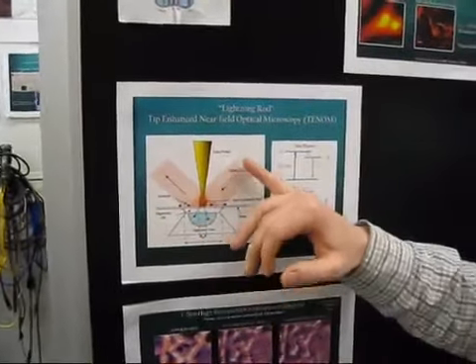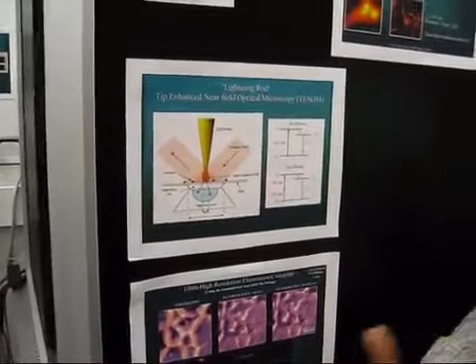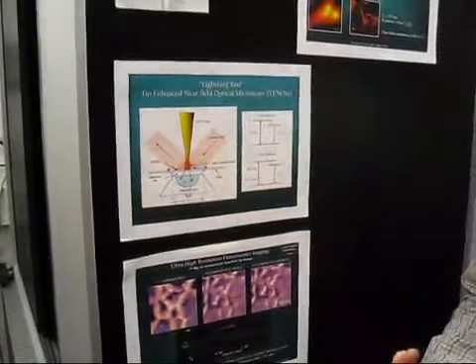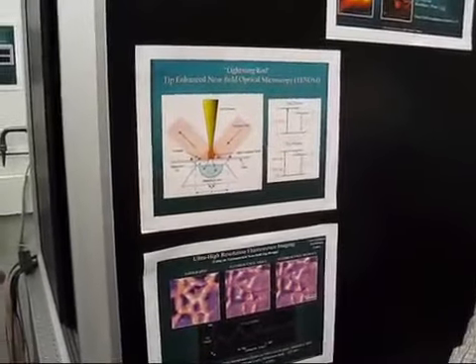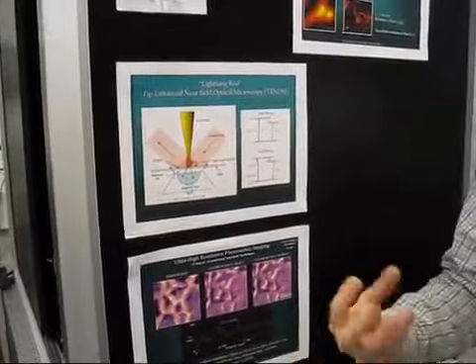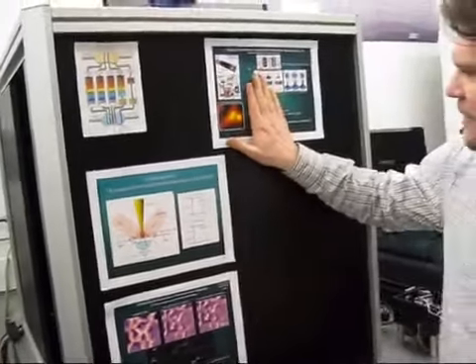Now what we do is take the background and lower it so that it doesn't cause the sample to react or fluoresce. Just the area in the highly localized field is what will cause the fluorescence of your sample, or the Raman imaging, or whatever kind of optical information you're trying to get back from the system. So this gives you a basic example.